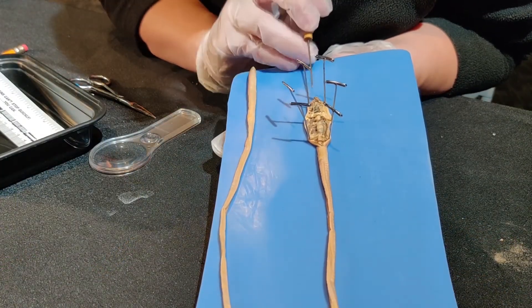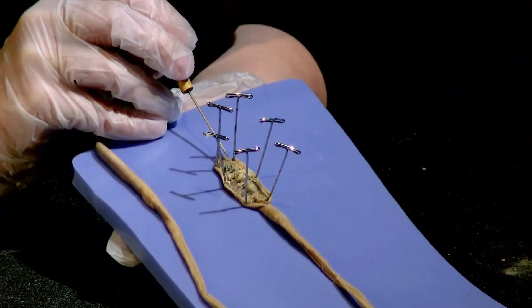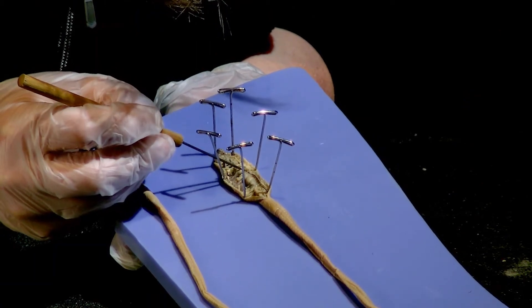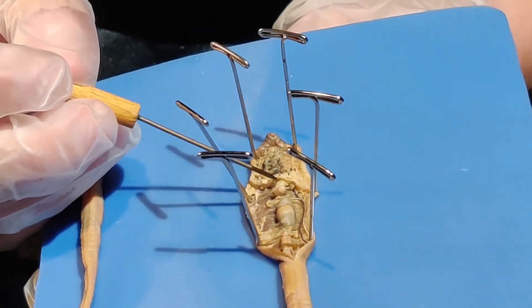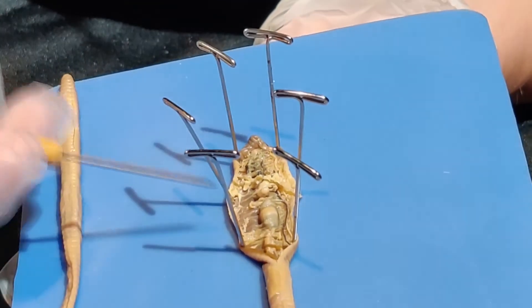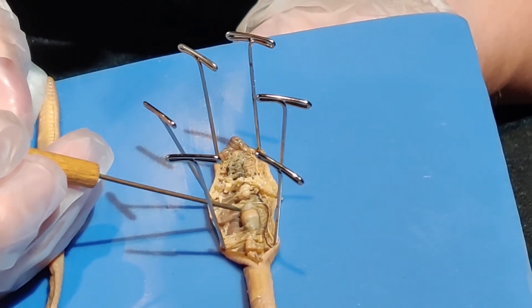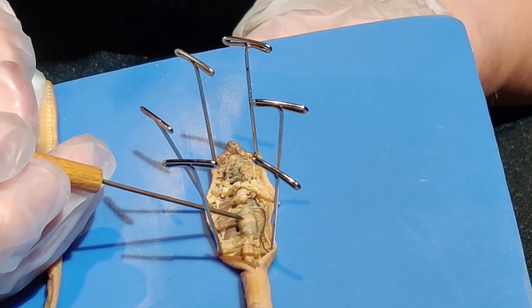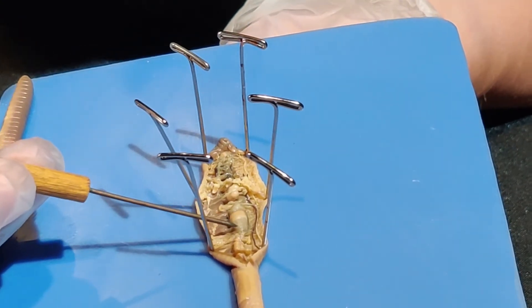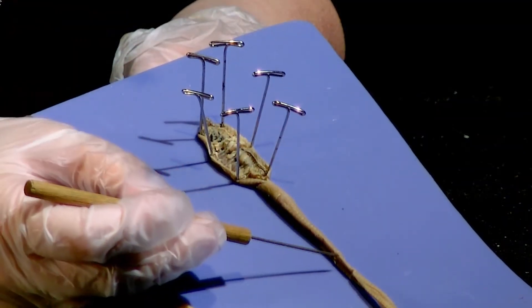Now we'll talk about the internal anatomy. Starting up here with the mouth, which you cut through, you're going to come down to this organ called the pharynx. The pharynx helps the worm hold its food and then push it down into its crop. Worms don't have teeth, so they have lots of small pebbles in their gizzard — a lot like how chickens do — that digest the food for them. After that, it will go into the intestine, which extends through the rest of the worm's body.